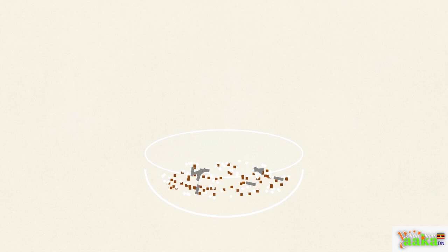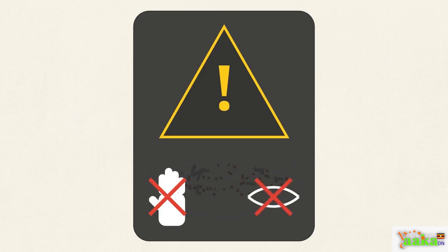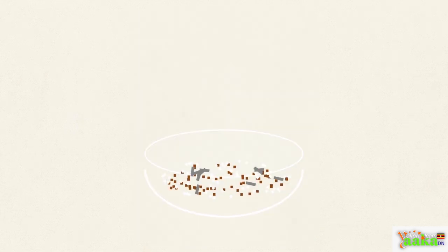matter. Here is a classic chemistry problem. We have a dry, complex bucket filled with sand, salt, and iron nails. We need to separate them into 3 pure, individual piles. Before we touch anything, we do a strict risk assessment. We establish our rules: no bare hands and absolutely no tasting the materials.